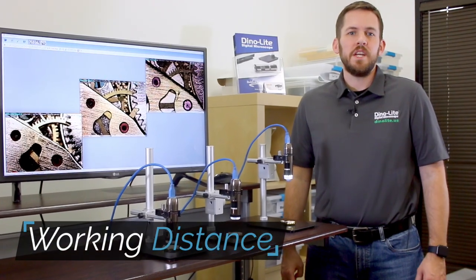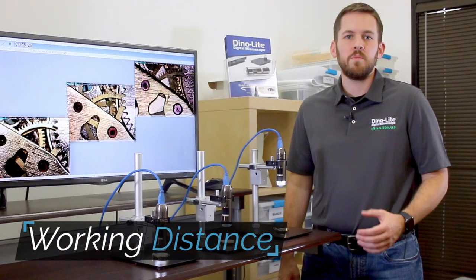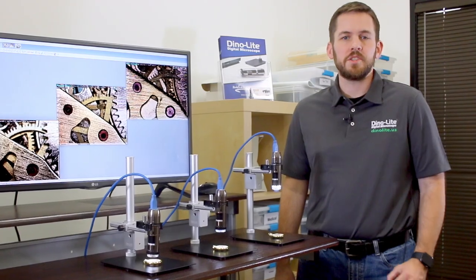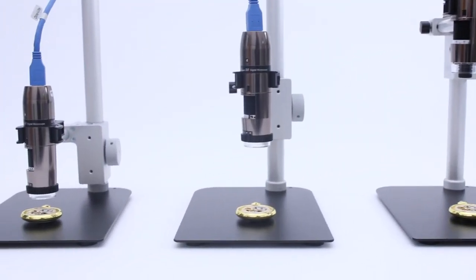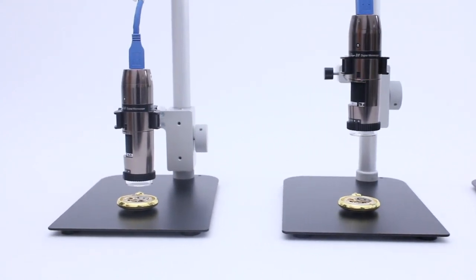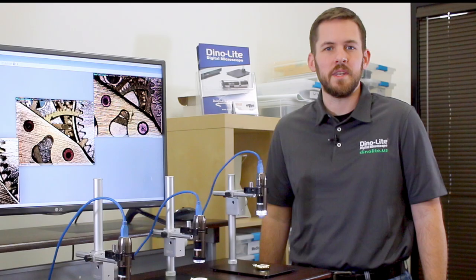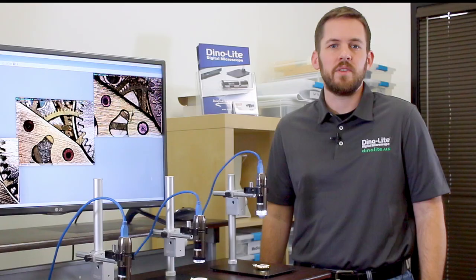Dynolite knows that some applications require a microscope with a different focal length than our standard design. These options help overcome challenges which require the microscope to be positioned further away from the specimen without giving up magnification.